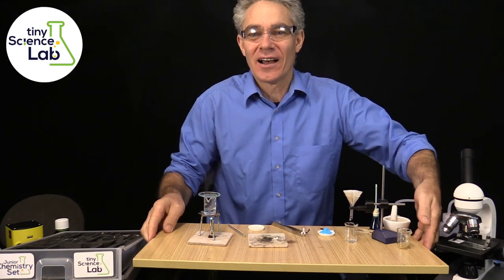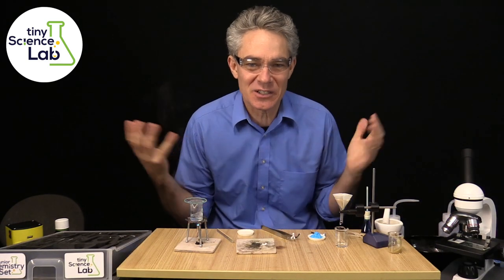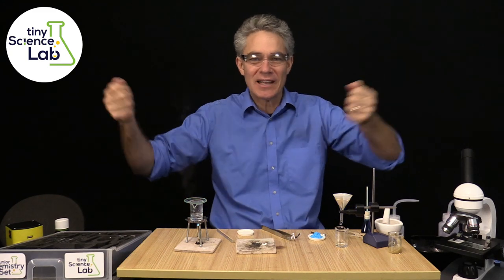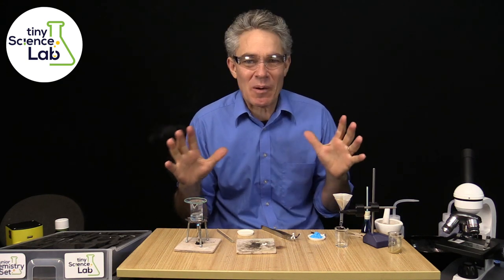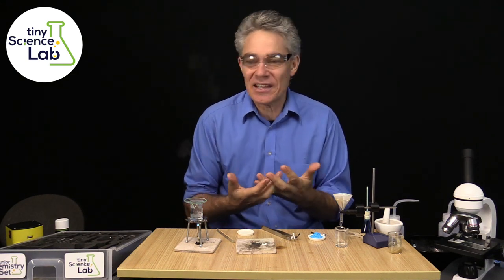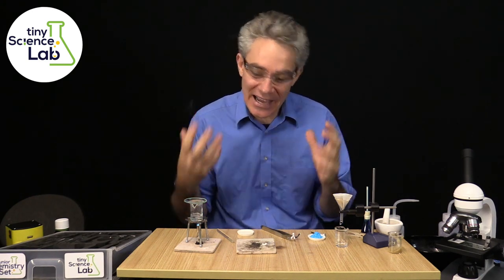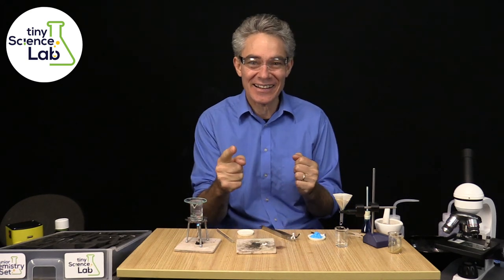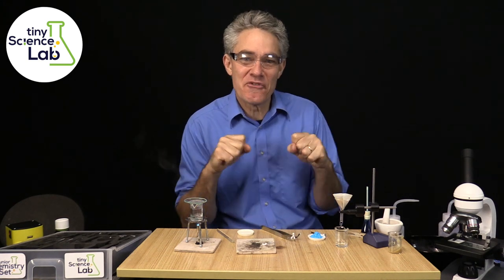You can actually take the entire lab outside. Anytime you want to do an experiment that's a little bit smoky to do in a classroom, just pick it up and take it outside. Last year, my eldest son said, 'Dad, I think what you've come up with is absolutely fantastic. I think you should start a company — I think schools would be very interested in this product as well.' Those of you who are leaders at school will know how expensive it is to set up science labs. The idea is that you can do any science experiment in any room. It's amazing.